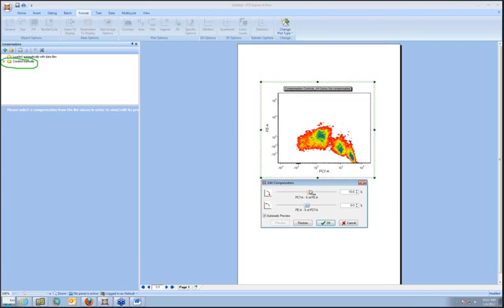And as you move the compensation slider to the right in this direction, the compensation moves in the direction of the picture. So if you move it to the right now, the compensation is moving down, and if you move it to the right here, the compensation is going towards the y-axis. Of course you can undercompensate and overcompensate. You can see how fast it is. This is happening in real time, and it works fairly quickly.